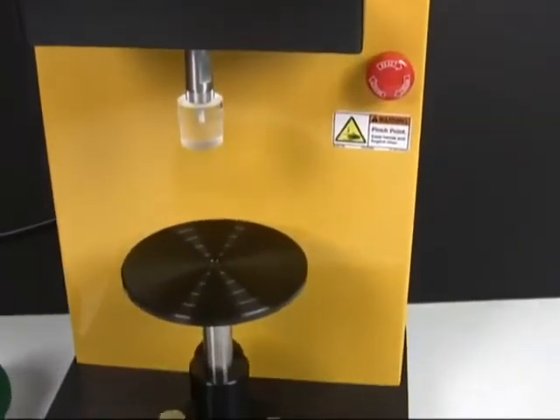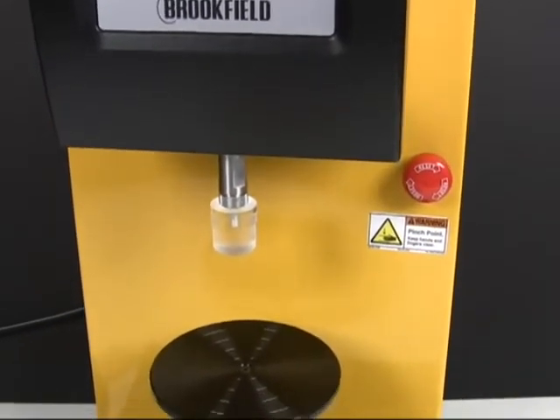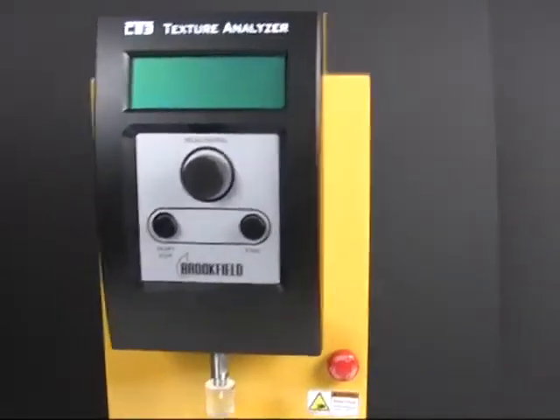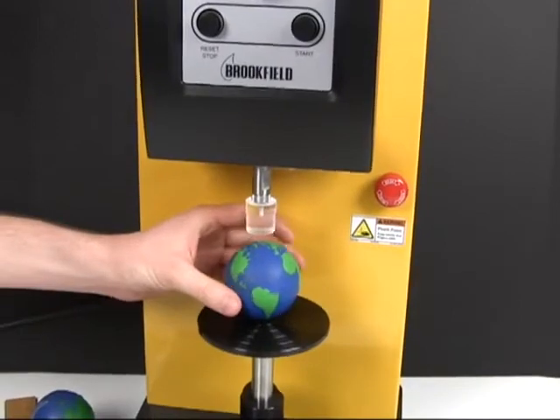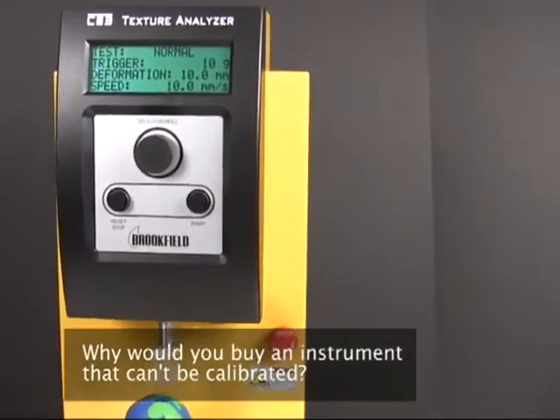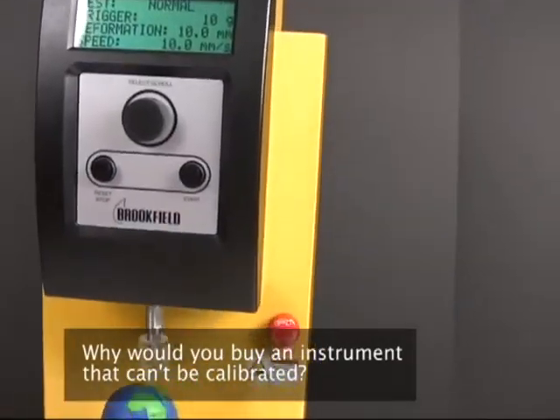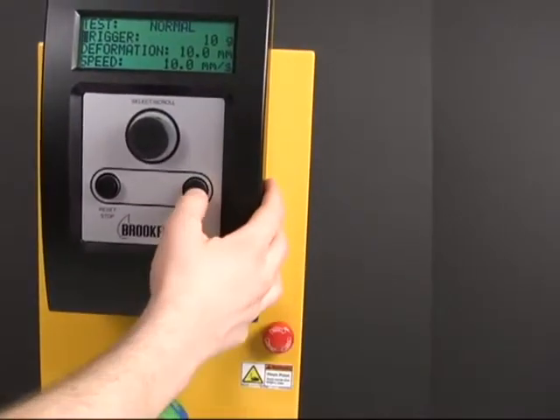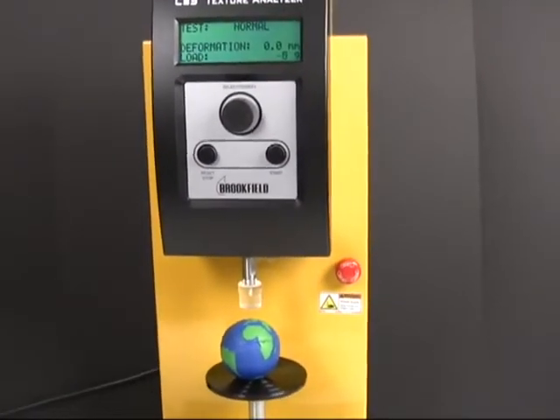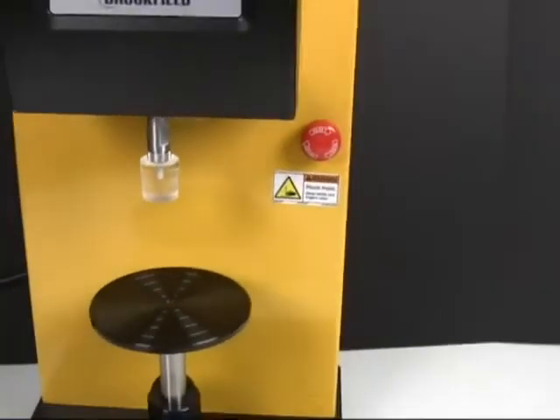The instrument also doesn't come with calibration hooks or extenders when you buy it with the default rotary table option, which is pretty inconvenient when you go and try to run tests. In terms of setting up a test, we found out that you just can't calibrate the instrument at all. If you did buy the calibration hooks and had the weights on hand, you can test and see how far it's off, but if it is off, you're going to need to send it back to Brookfield to get calibrated. ASTM-E4 requires calibration when instruments are moved, and this lack of calibration is a big issue in industries that need FDA approval, such as medical, medical device, food gel, or cosmetic companies.